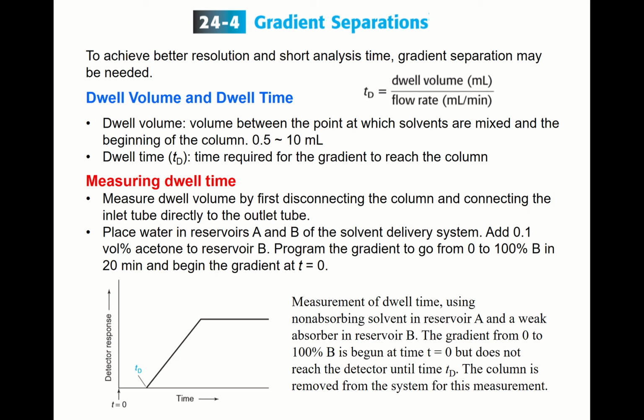Since there are other volumes before the column, like sampling volume and so on, it takes time for the sample to reach the inlet of the column. Let's first define the dwell volume. Dwell volume is the volume between the point at which solvents are mixed and the beginning of the column.